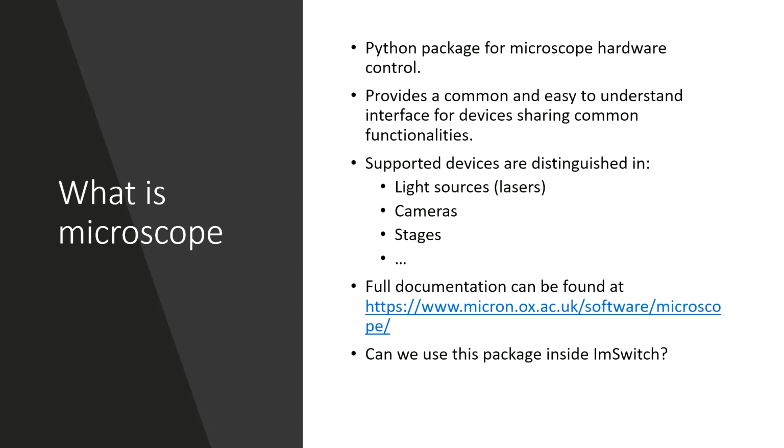So first things first, what is Python Microscope? It's a package for microscope hardware control, which can provide a common and easy to understand interface for devices sharing common functionalities. Supported devices so far range from light sources, cameras, stages, and so on. But you can find full documentation about the package on their website.